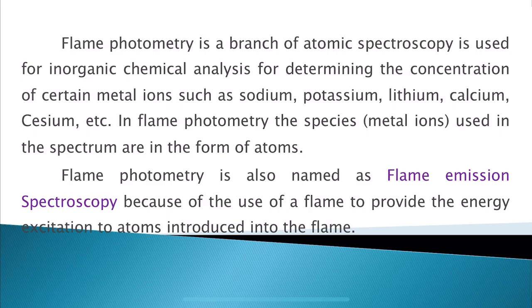What happens here is, when these elements come in contact with the flame, excitation of the source is observed, and an electronic photodetector is used as the measuring device. Once these elements come in contact with the flame, they excite from their lower energy state or ground state to the higher energy state.